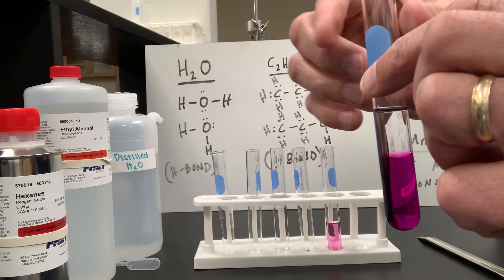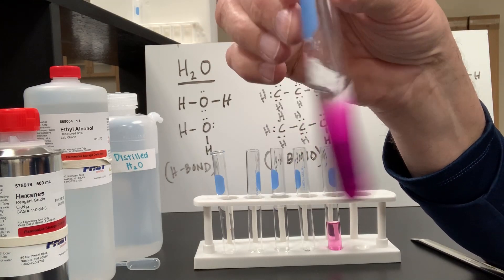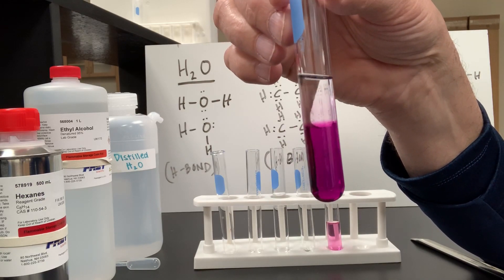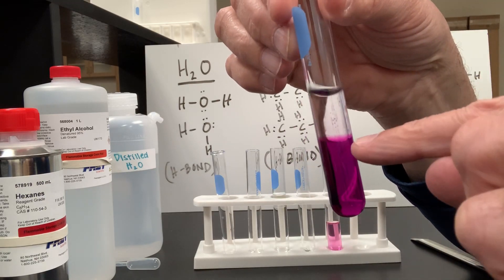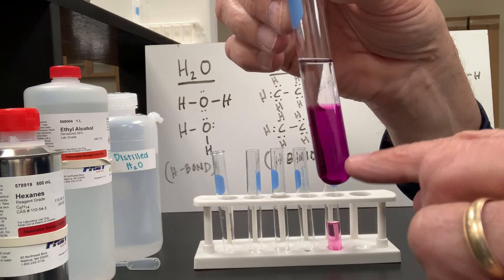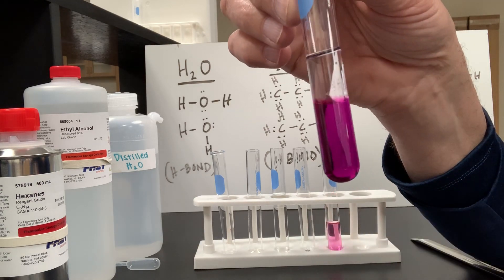Are you surprised at all by that? Or is that what you expected? Yeah, the hexane will not interact with the potassium permanganate, no matter how much I shake it. Take a look. We end up with the two layers. We have that barrier there between hexane, which is non-polar, and my potassium permanganate and water mixture.